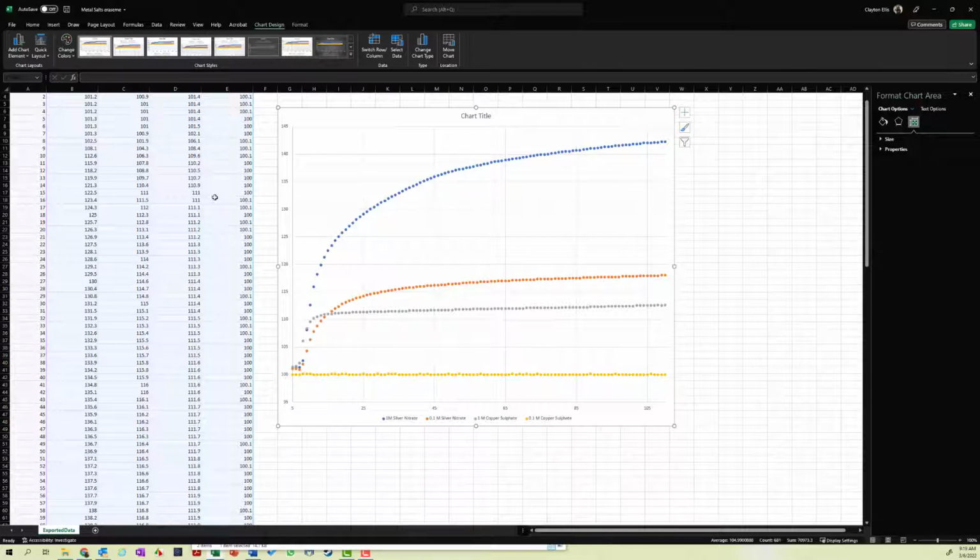Someone asked if you're able to go in and just take a sample point once every second. You could do that, but that would take forever, and it's not really necessary. Just know that the next time we collect data, you can change the periodic sampling rate from the default to once or twice a second, and that should be plenty for a pressure experiment like this. Okay, so hopefully that gives you an explanation of how to take in your data, how to change your data, how to save it, how to put it into the Google Classroom for everyone to use, and also how to create your own graphs.